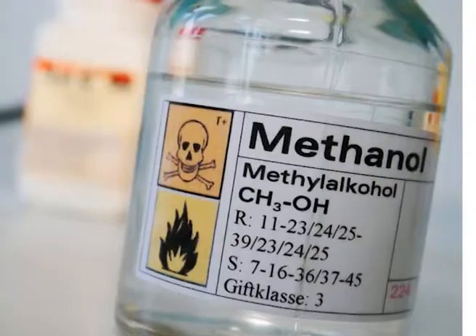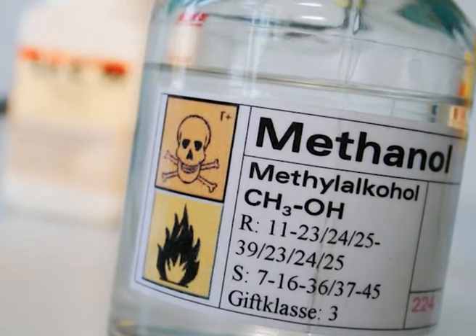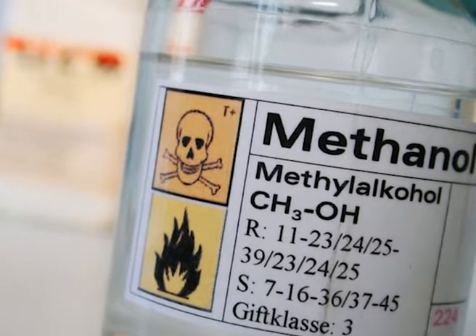The reagent dissolves in most organic solvents such as methanol, ethanol, acetone, diethyl ether and naphtha. The choice of the solvent depends on whether the document is scripted or not. Most organic solvents tend to despoil the calligraphic script.